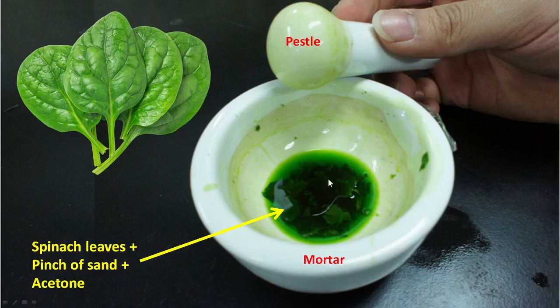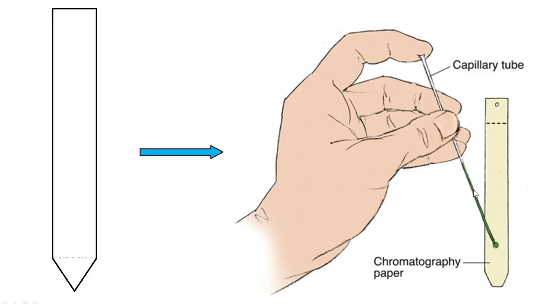You can use a capillary tube to apply the extract onto the paper. This is a Whatman filter paper, also called chromatography paper — it's a special type of paper. You should not write on it with a pen or ink pen; you should mark it with a pencil only.